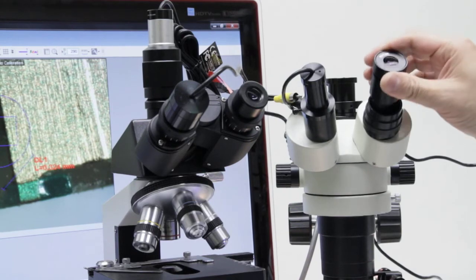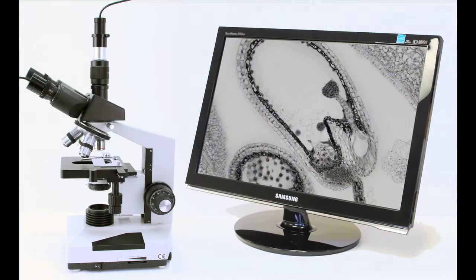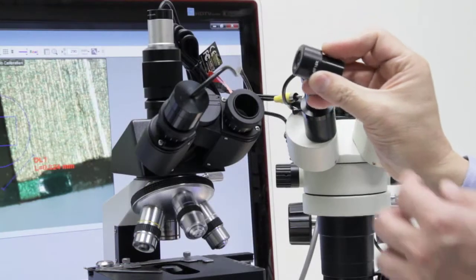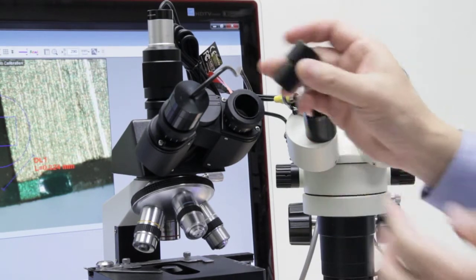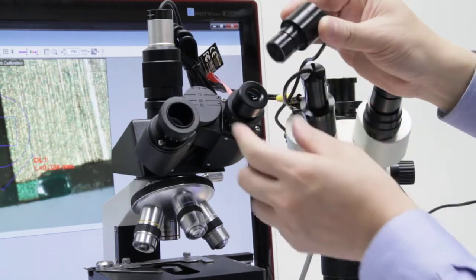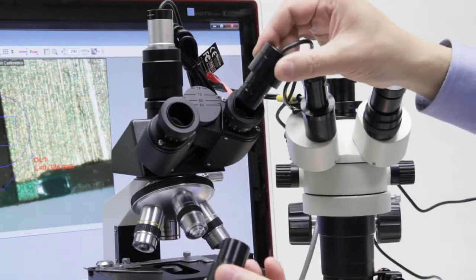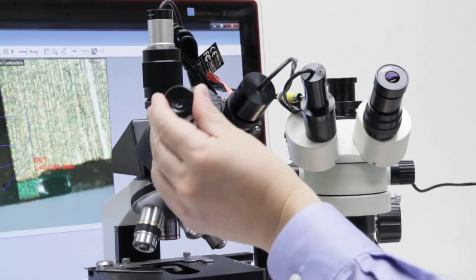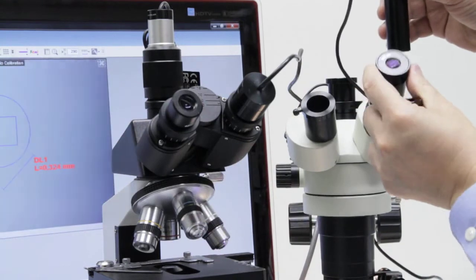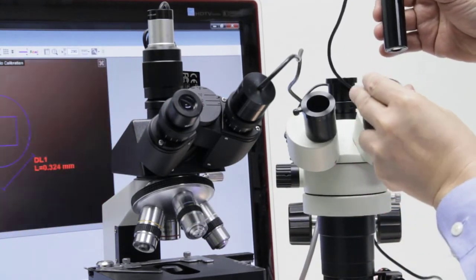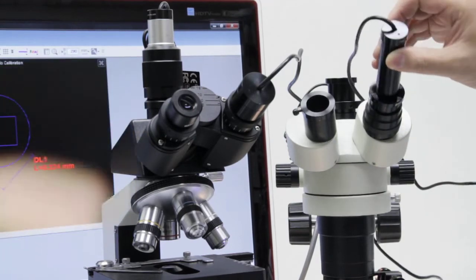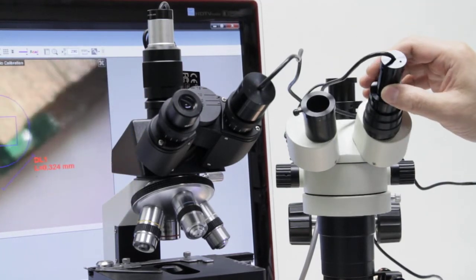For compound microscopes, eyepieces are usually 23 millimeter and typically 16X, 10X, or 20X magnification. Just remove the current eyepiece and replace it with the AM423 or 7023. As another example, remove the eyepiece, insert the 30.5 millimeter adapter, and slide the AM423X for perfect fitment.